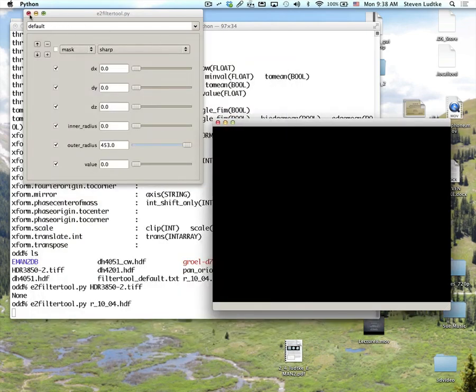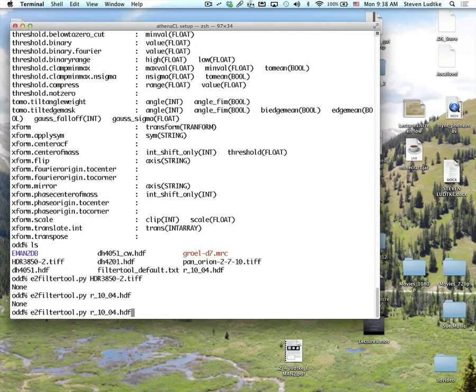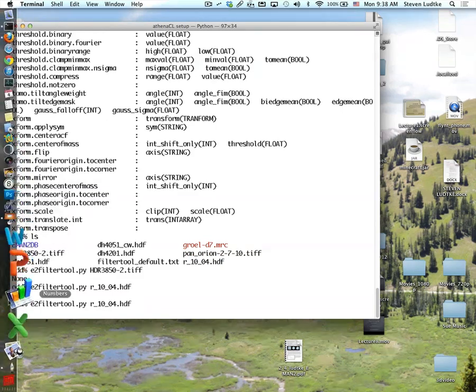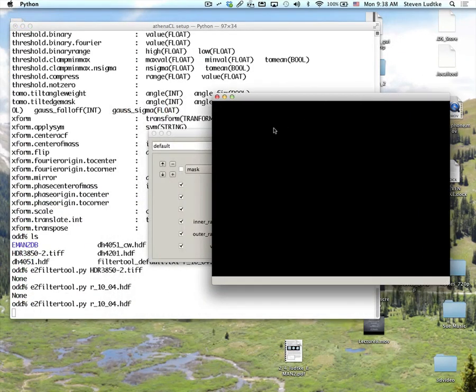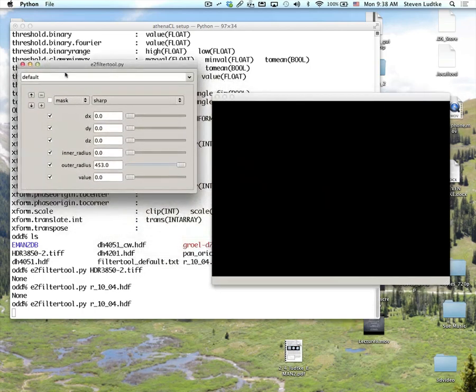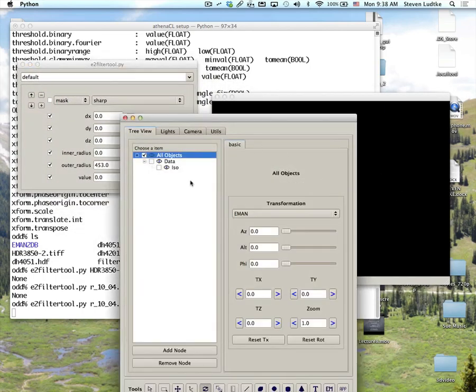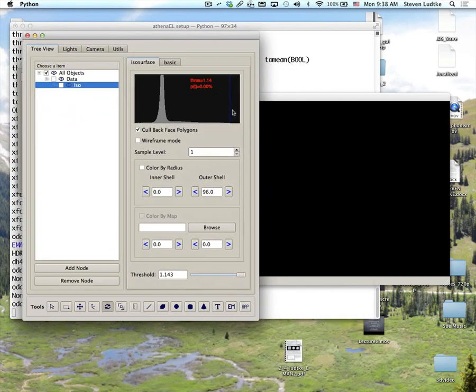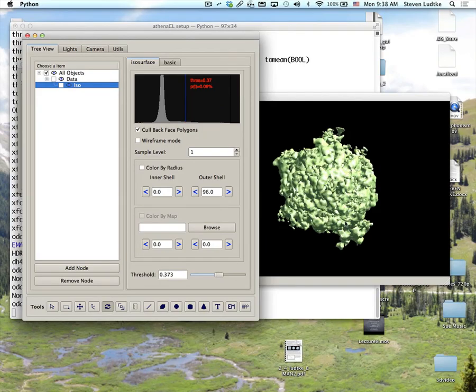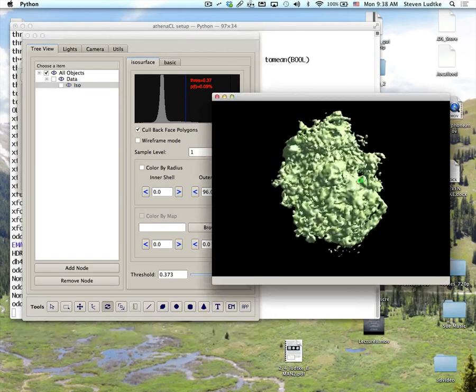All right, let me just start this again, just to get the defaults right. Huh. Oh, I see what's going on. I just don't have a good isosurface set. There it is. The isosurface threshold I was using was just too high.